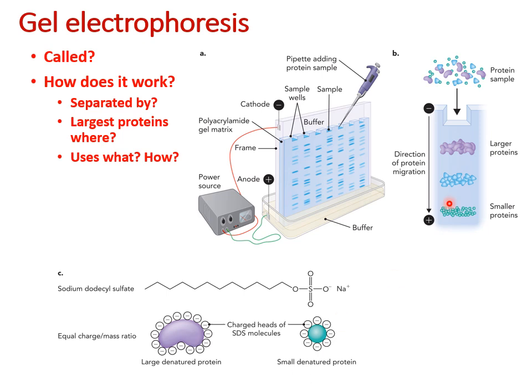So you can make a gel with a higher percentage, lower percentage that will adjust which proteins can travel through the pores, because that will adjust how dense the gelatinous gel is and how the proteins can migrate through. So that will be valuable for you if you want to separate proteins that are closer in size to each other. You can modify the percentage of the gel. Okay.